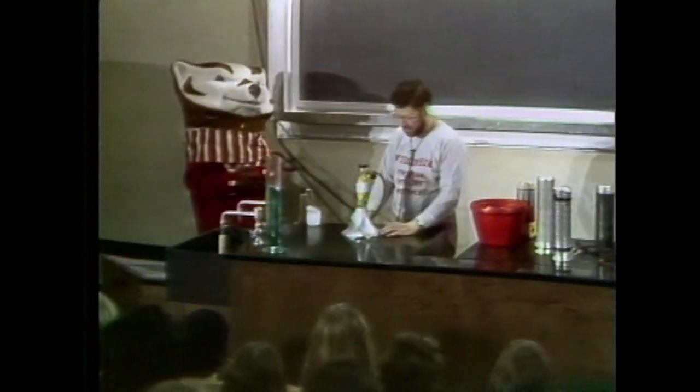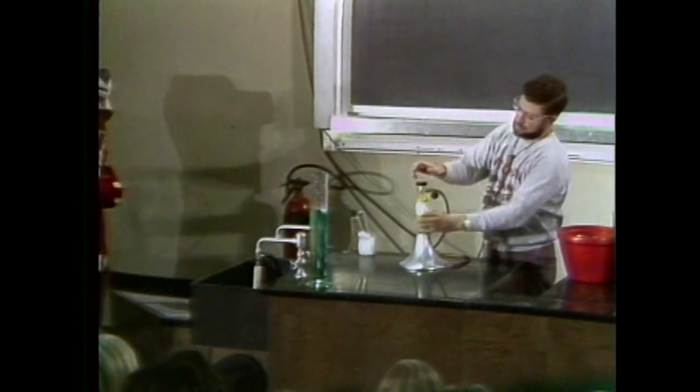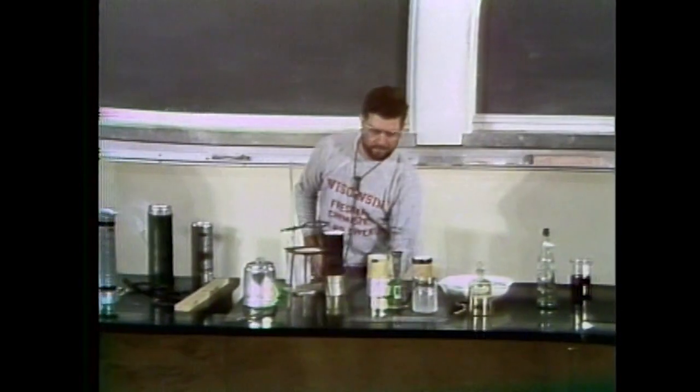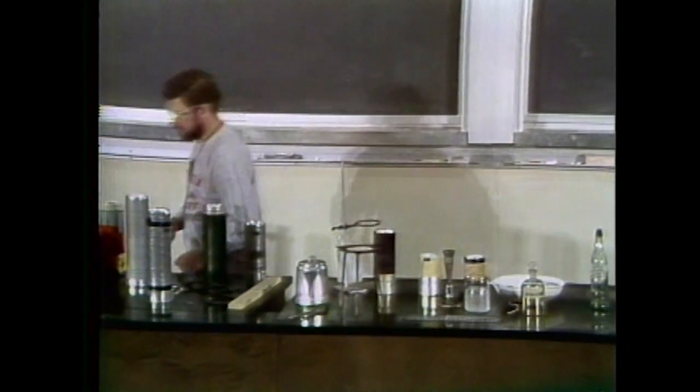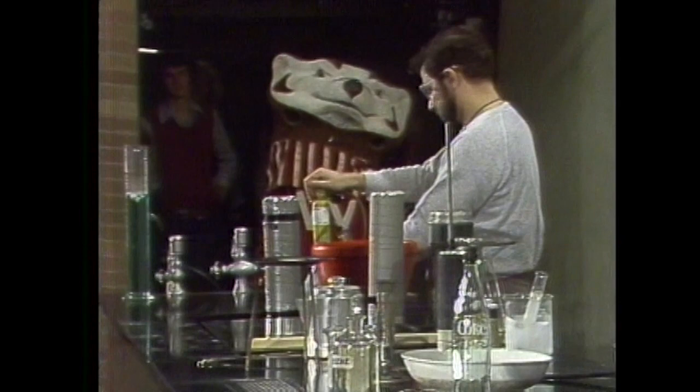I'm going to try to make you feel at home, and I'm going to use another gas here. Actually, this pop turned off my gas over there. So let's use this and see what happens here, Bucky.